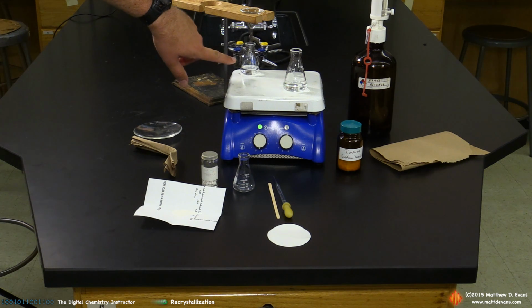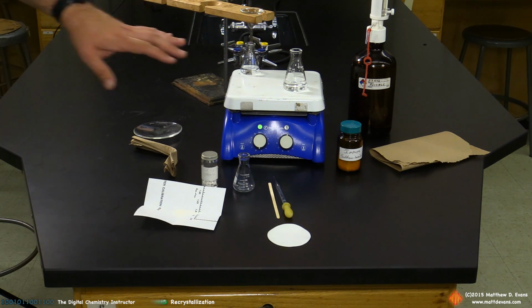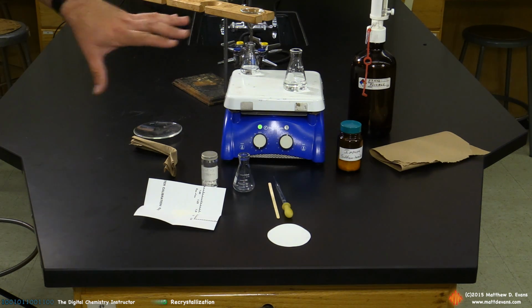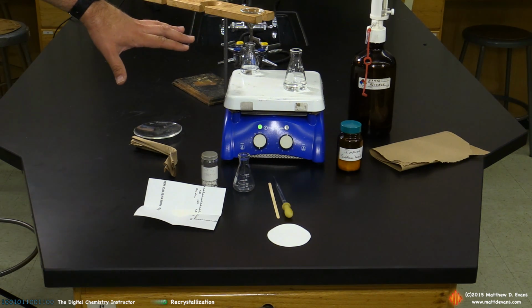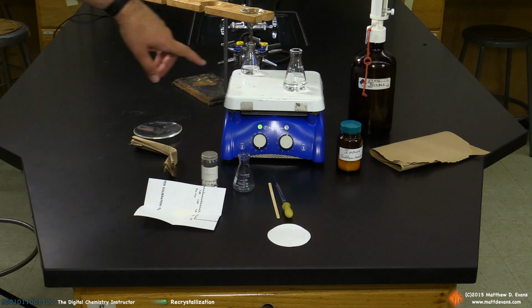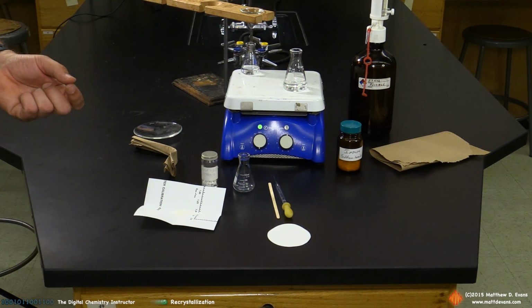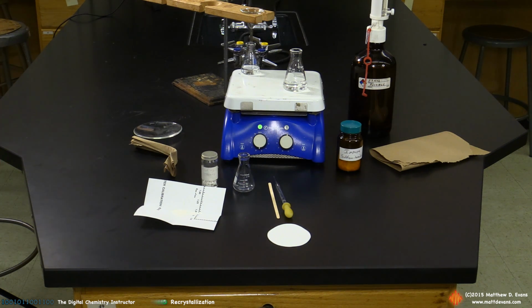I've also got another flask on here just in case we have to do a hot filtration. This is excessively full right now. We don't normally need it this full, but I want to make sure that it doesn't evaporate completely during the course of this experiment. We won't need to use this, but just to show you, a hot filtration is sometimes necessary if we see that our compound is not dissolving and there's some sort of insoluble impurities inside there.